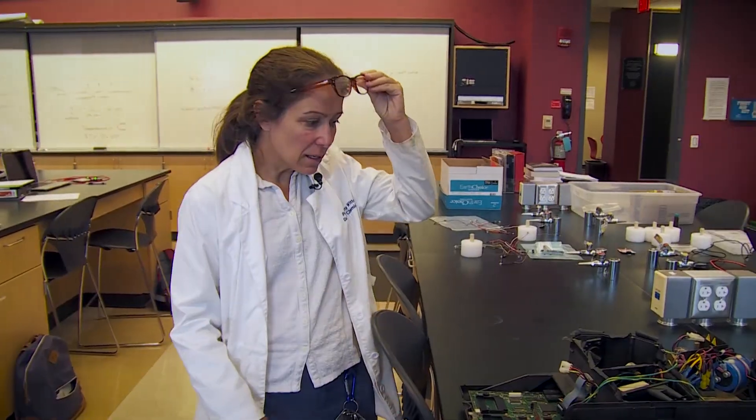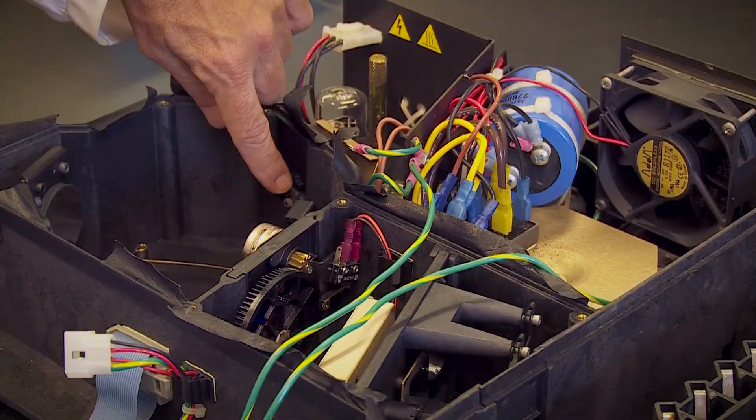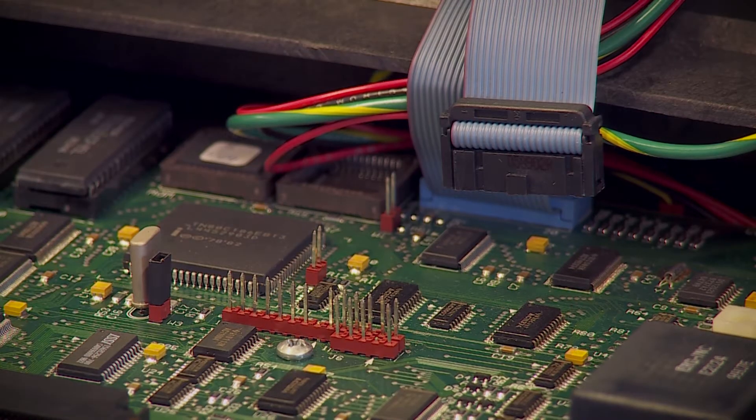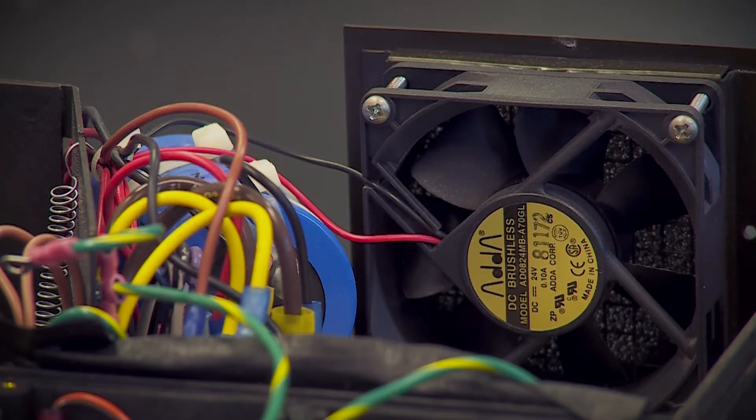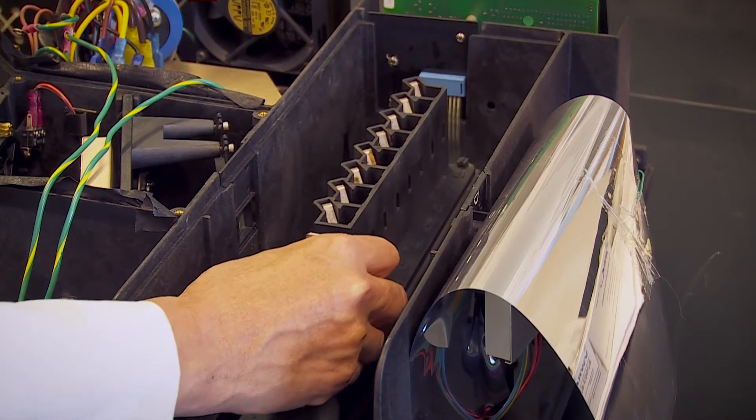What we have here is a commercial spectrophotometer — we stripped away the top of it. Now they have the basic idea of what's going on inside here and what they need to do to mimic this design in their own design that they're going to build.